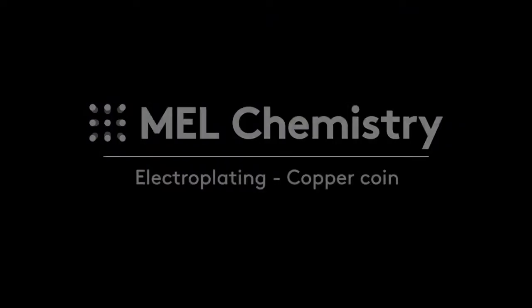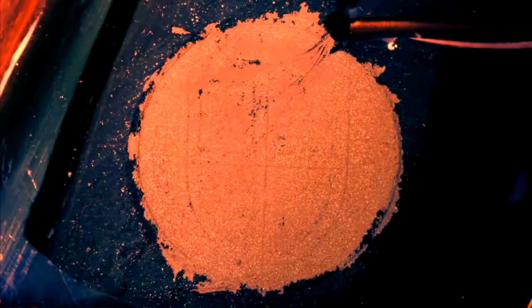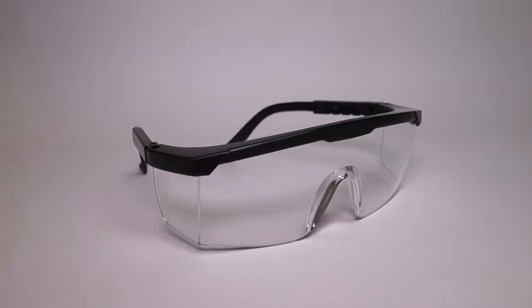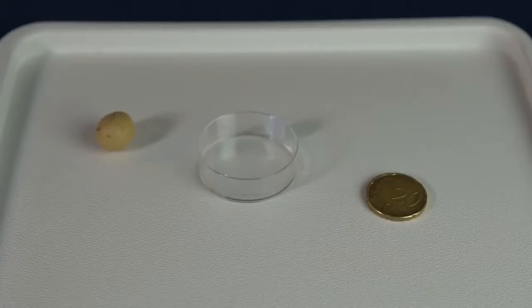Today, with the help of MelScience Electroplating Set, we will make copper coins by ourselves. For this experiment, take a small Petri dish and flatten a Play-Doh on it.